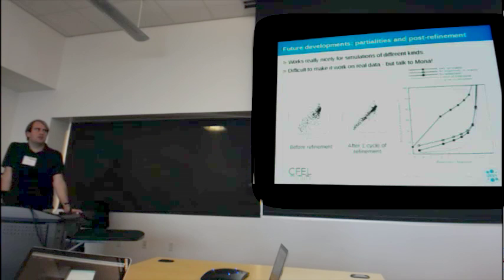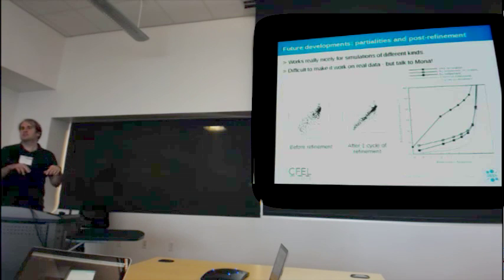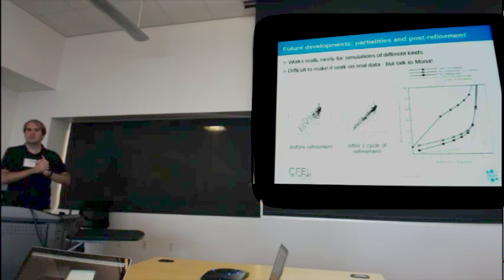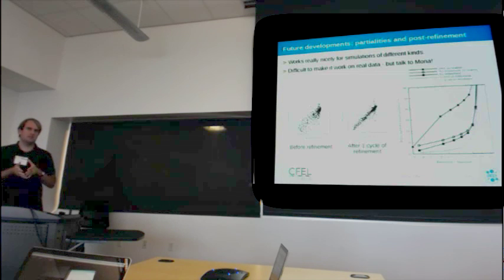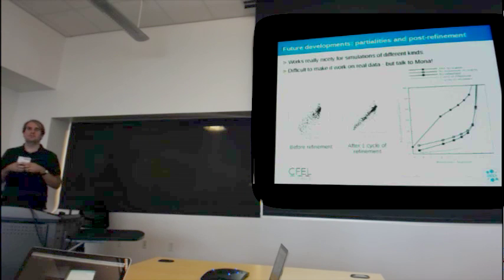The next step was to ask how much noise we get just from indexing. So what I've done since then is to draw dots into diffraction patterns at these locations and index that. That gives you an unbiased estimate of how accurate your rotation will be from indexing, and it actually works even better than this. So I think just from indexing, the orientations are good. What I don't know is how much the errors that we have compromise this. But I guess that can be tested.